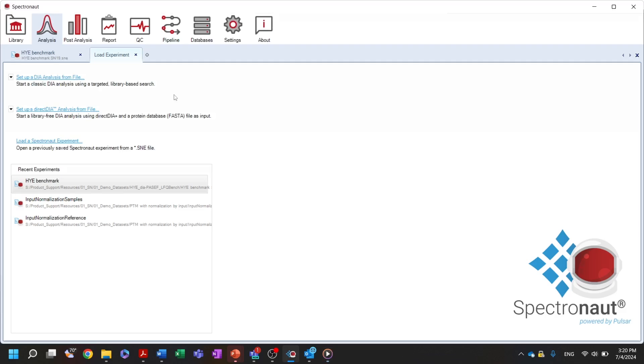The analysis perspective allows users to start a new analysis with a previously generated spectral library using the library-based DIA analysis, or without a library using the direct DIA workflow.